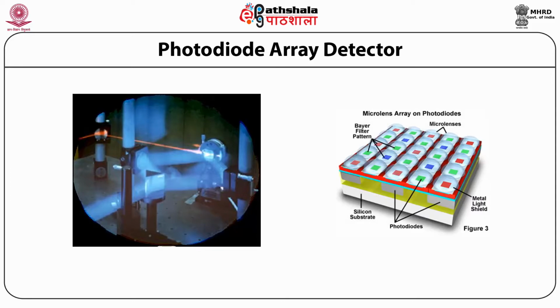So each and every photodiode is having a particular wavelength to deal with. Therefore, continuously one will be able to monitor different absorption of compounds in different nanometers. So here you get a three-dimensional view of the data, and in one single run you'll be able to understand more than one compound having a different molar extinction coefficient at different wavelengths. All these things can be observed. It's the next version of ultraviolet detection, with multiple wavelengths done simultaneously.